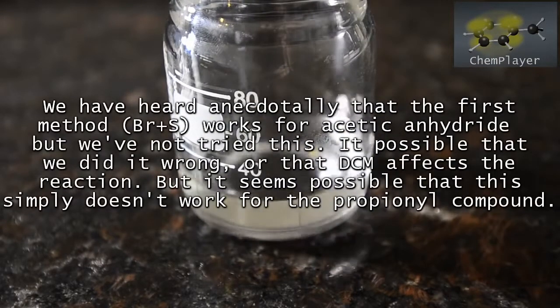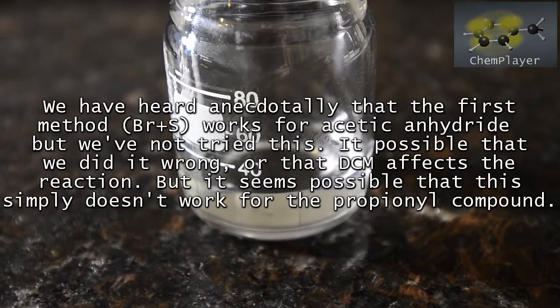So we don't know why the first method didn't work. It's possible that it requires longer refluxing. Or perhaps the DCM affects the reaction in some way. But the fact that we got nothing at all suggests to us that it possibly simply doesn't work for propionic anhydride.